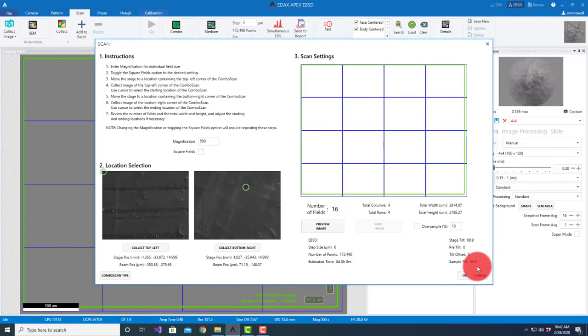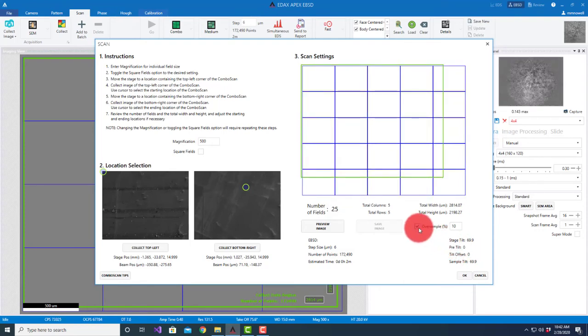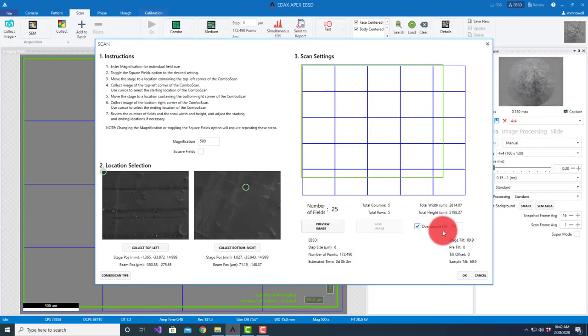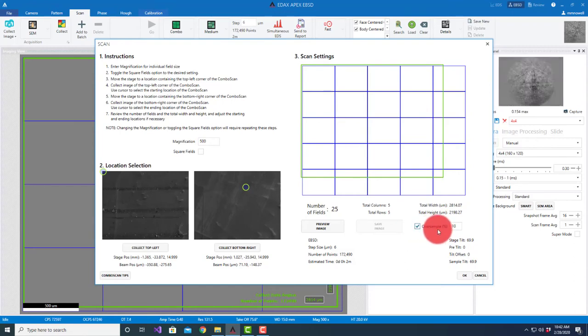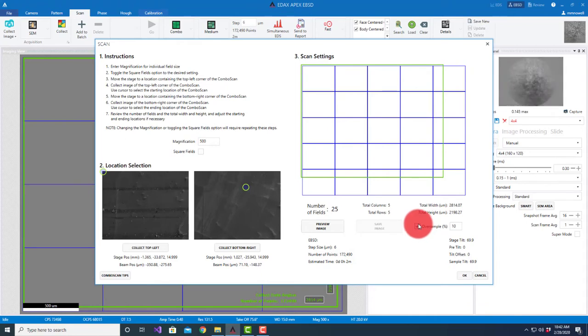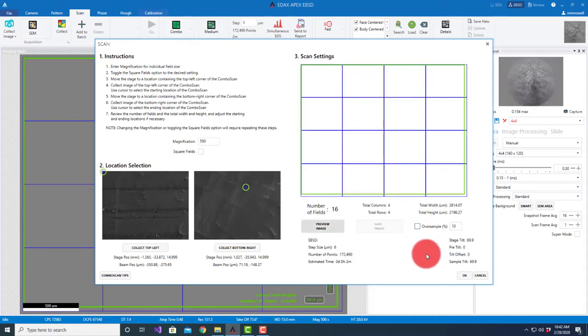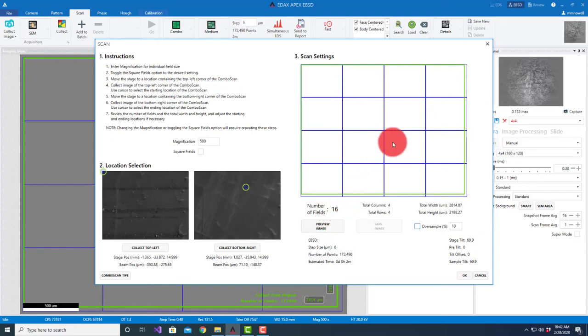We also have the option of what we call oversample. Oversampling will end up sampling regions and having areas that can be used to stitch together things in OIM analysis a little bit more precisely because you have areas that you can move things back and forth. I'm going to use the standard one for now for this demonstration. We have the option of doing a preview image where we'll collect an SEM image of each one. I'm not going to do that.